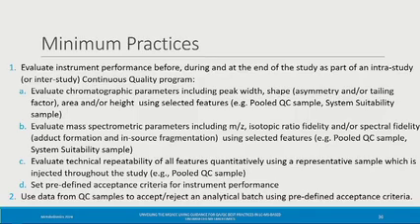So for the consortium, we don't want to propose acceptance criteria because this will really depend on the purpose of the study, exact application, and what exactly you are trying to do. But generally, when we polled about that metric, most of the people were between 20 to 30%. So it was about, I think, 60% of people were using one of those two numbers. Okay, thank you very much.